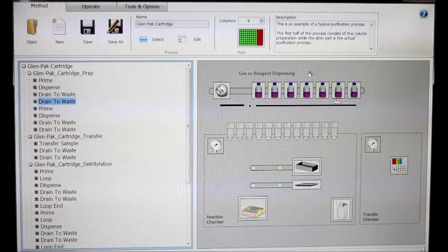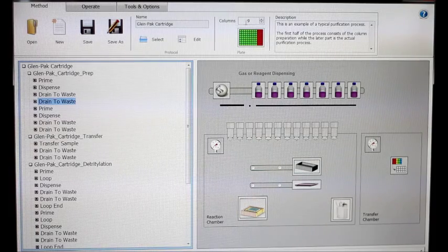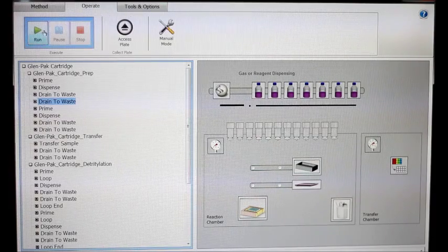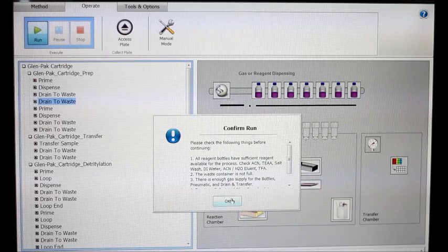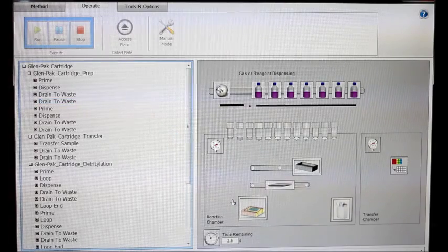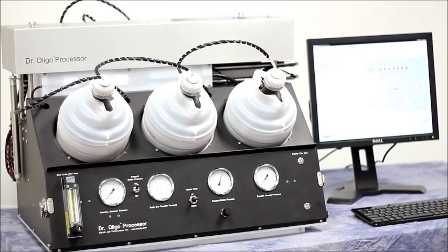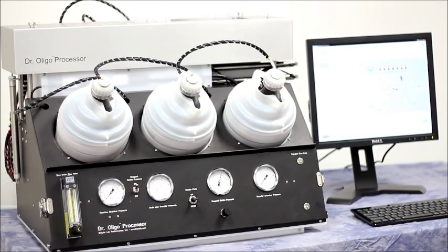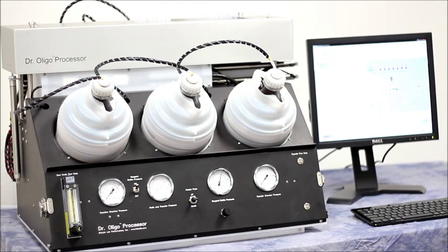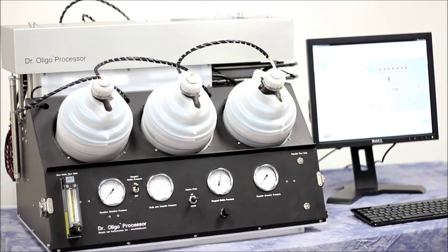Once you've selected the protocol and the number of columns you want to run, head to the operate tab and simply click run to begin your process. What you're hearing now is the valves turning on on the left-hand side of the reaction chamber, first purging with clean nitrogen gas and then dispensing the first reagent of your process to prime the lines.